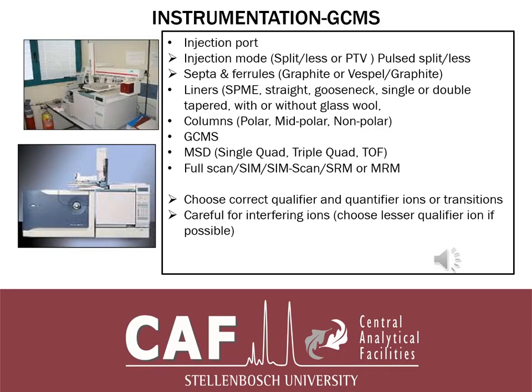Now next we come to the instrumentation part. The GCMS chromatograph consists of the injection port, and you've got the injection port, you've got the GC column, and you've got the detection part.